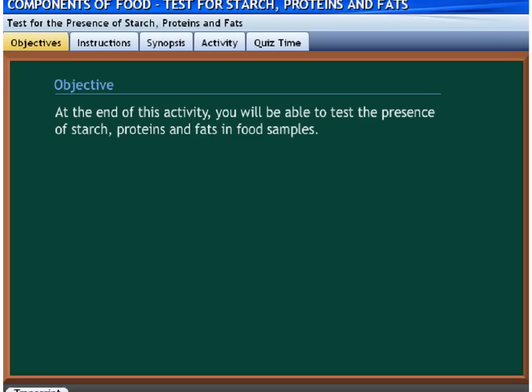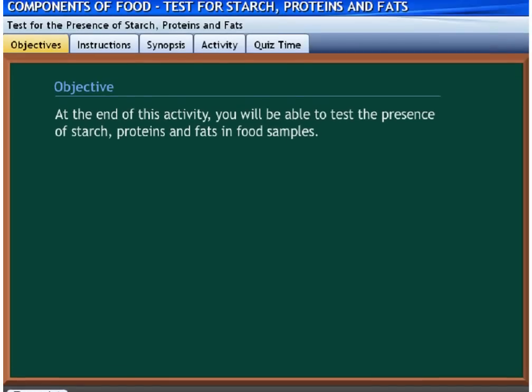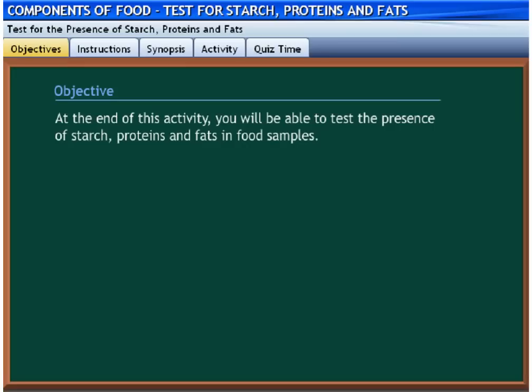At the end of this activity, you will be able to test the presence of starch, proteins, and fats in food samples.